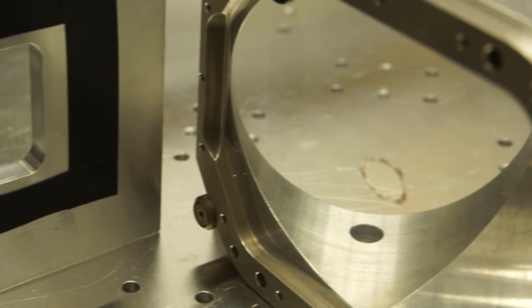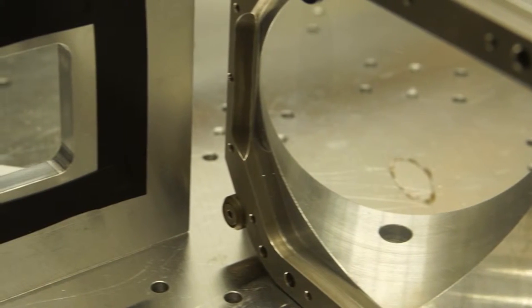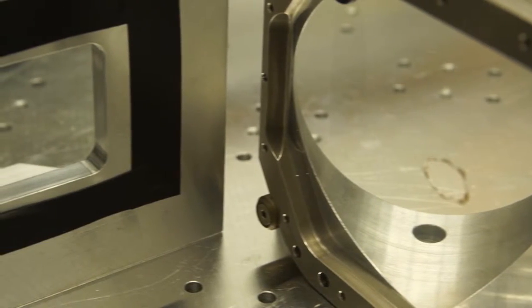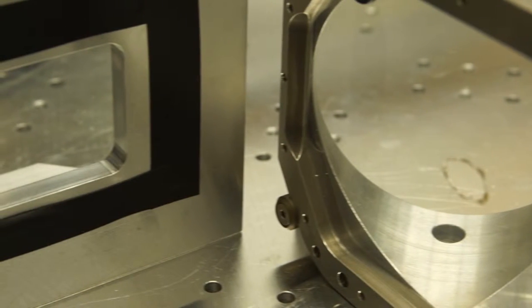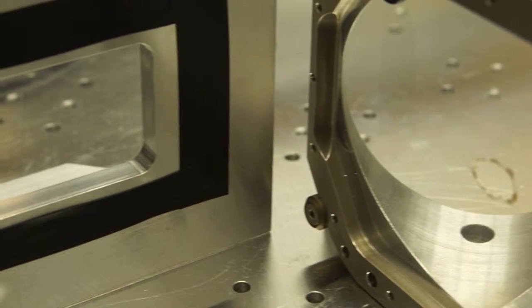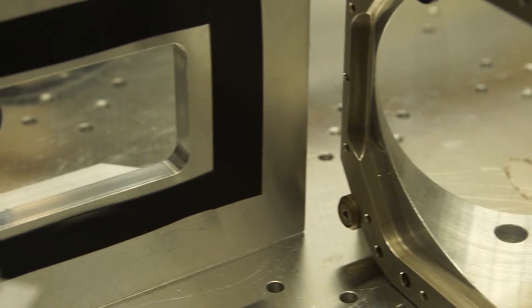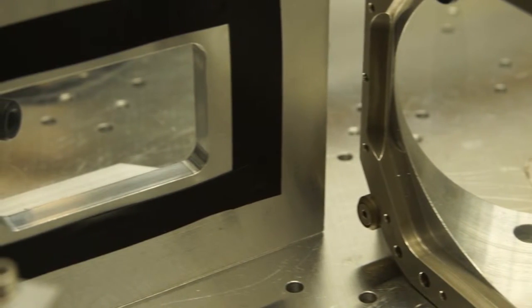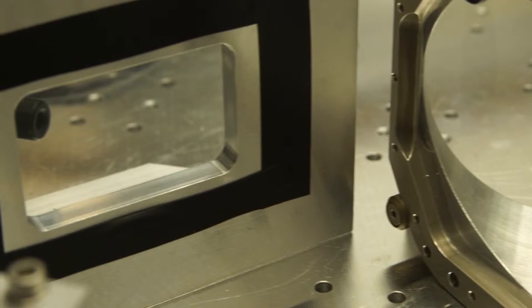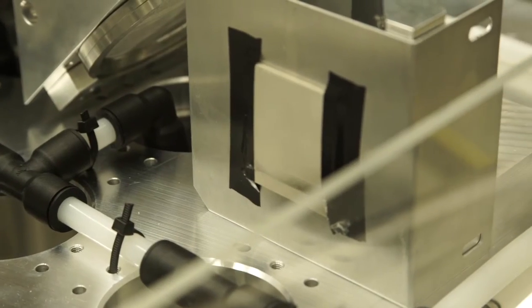To conclude this lab tour video, I'd like to show the effect of high-power microwaves on different materials. Mylar is commonly used as a beam splitter or window for high-frequency microwaves, especially for EPR applications, but at high power as used in DNP with a gyrotron, it simply melts. Instead, a polyethylene film is used to sample the beam. Polyethylene film makes a perfect beam sampler with a ratio of 1 to 10,000 — so 1 milliwatt of split beam for 10 watts of forward microwave power from the gyrotron — allowing our pyrometer to track the microwave power going to the sample.